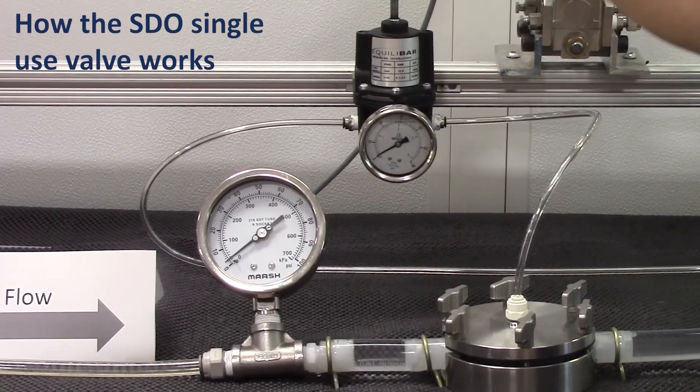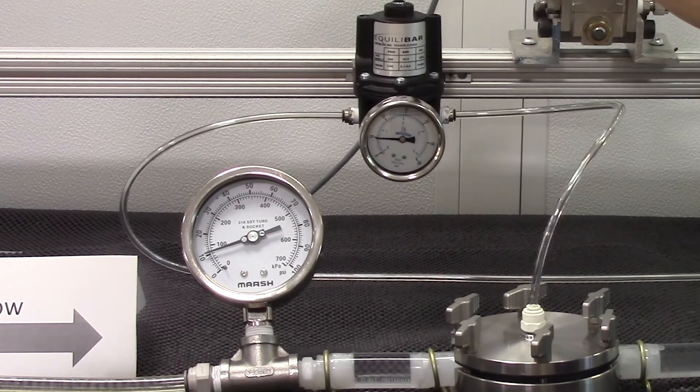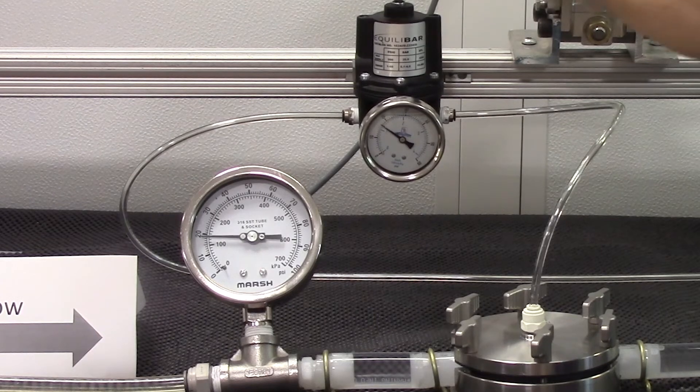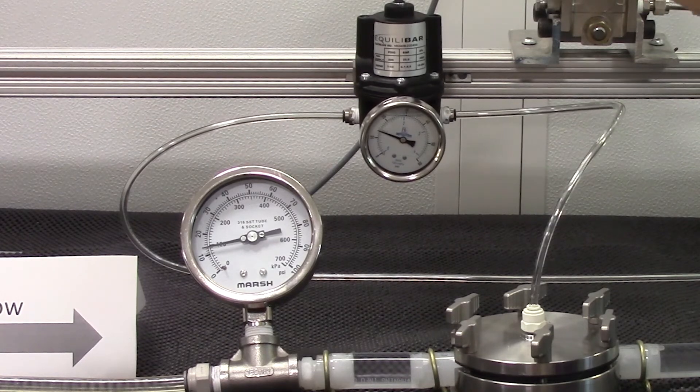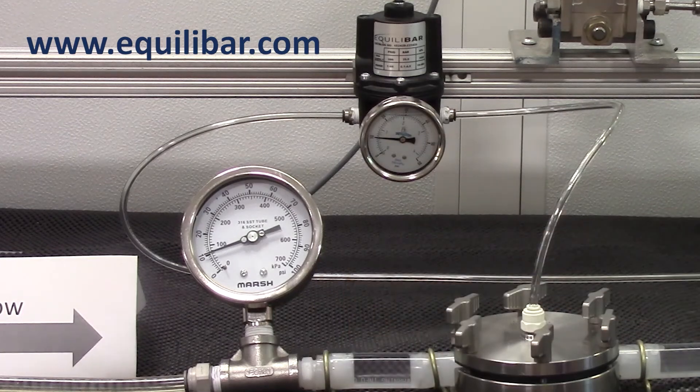When I increase the dome pressure of the Equilibar we see an instantaneous and equal increase on the inlet pressure. I'll increase again and we see not only an instantaneous matching inlet pressure on the rise but on the fall as well. So this demonstrates the stability and precision of the Equilibar single-use back pressure regulator.